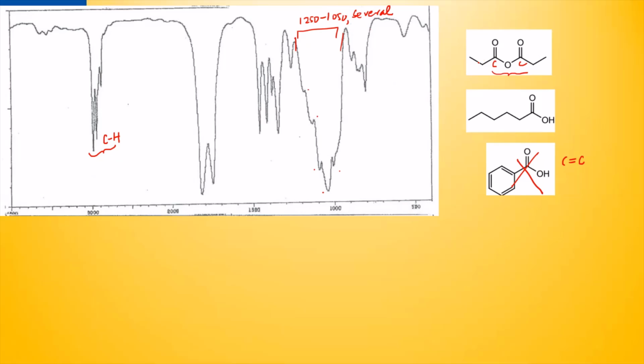if you go look at the anhydride, there's a C double bond O, right? You see they didn't put a range. They also gave a comma for 2 separate values. One is from about 1840 to 1800, and the other is about 1780 to 1740. These are the ranges that they're talking about for the 2 peaks.